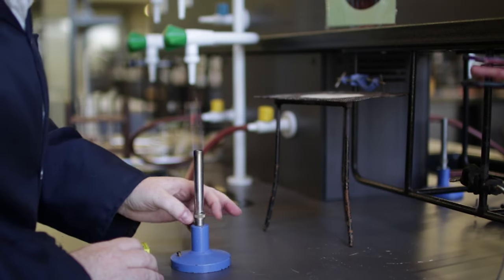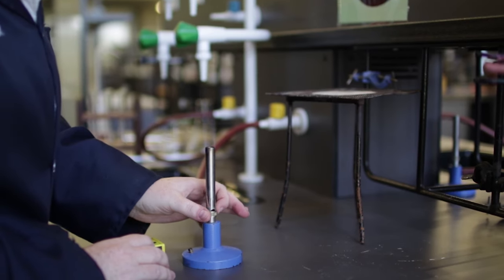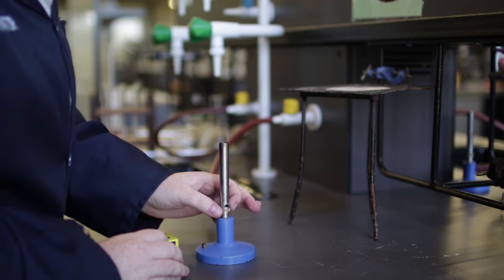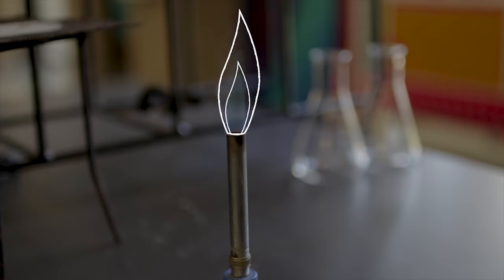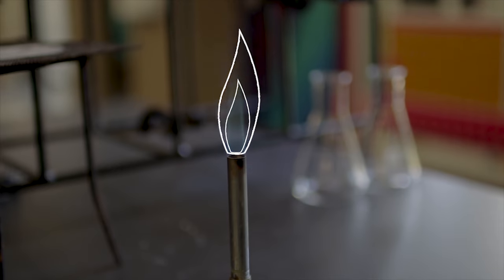Step 4: The non-luminous flame is achieved by rotating the collar to open the air hole and increasing the air supply. The non-luminous flame has the perfect amount of air supply when the flame shows two distinctive phases within the flame.